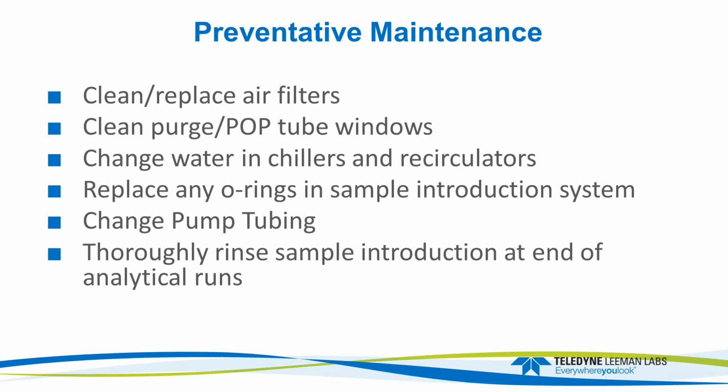Now, if you have instrument component failures, that's a different story. But for the things that you can affect on the sample introduction system, if you do that maintenance, it'll seriously reduce the number of problems that you wind up having.